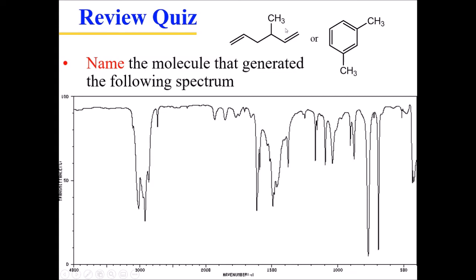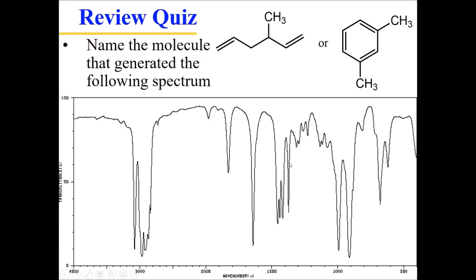So then what would this compound's spectrum look like? Well, it looked like this. This diene right here is also going to produce a peak at 3,100. That's because of the hydrogens coming off of the carbon that's part of a pi bond. You have these peaks just below 3,000, which is because of all these sp3 carbon-hydrogen bonds.